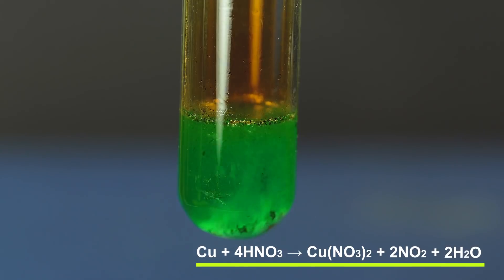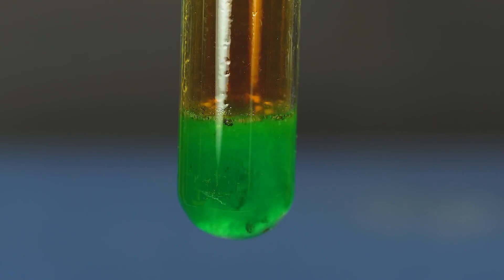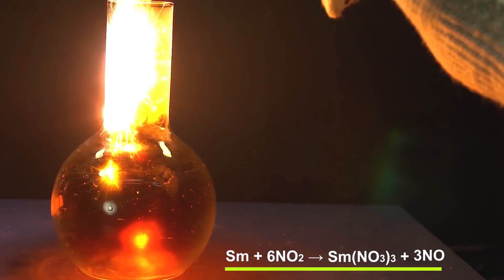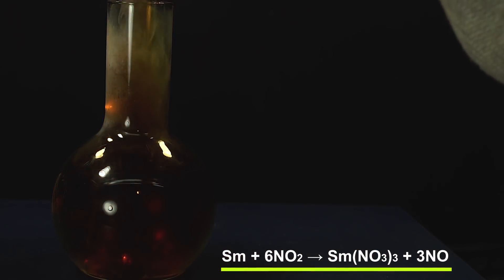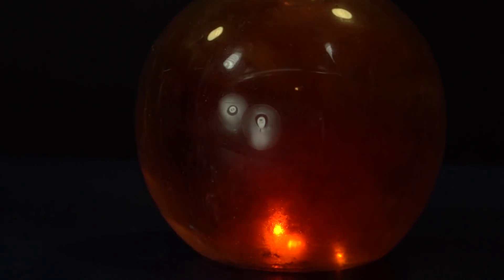This can be demonstrated more simply by burning the samarium powder in a nitrogen dioxide atmosphere. In order to fill a flask with nitrogen dioxide, I used the reaction of copper with nitric acid. As you might have noticed, samarium powder was burning actively in the nitrogen dioxide atmosphere.